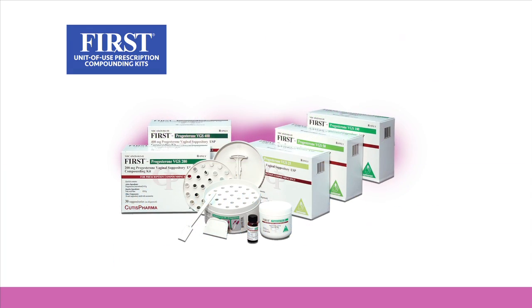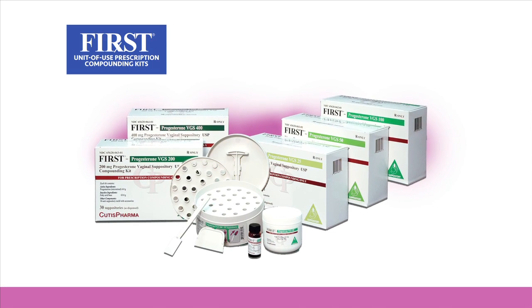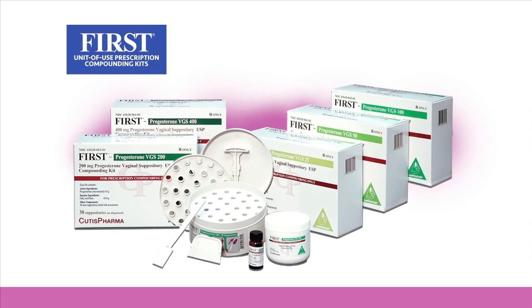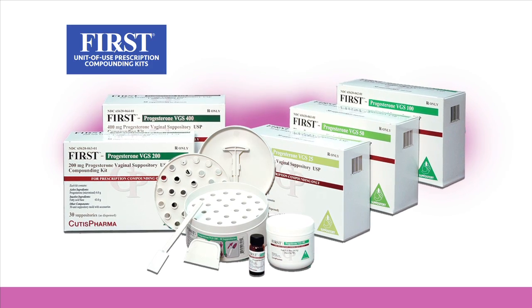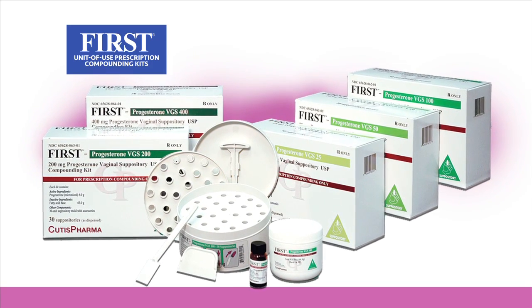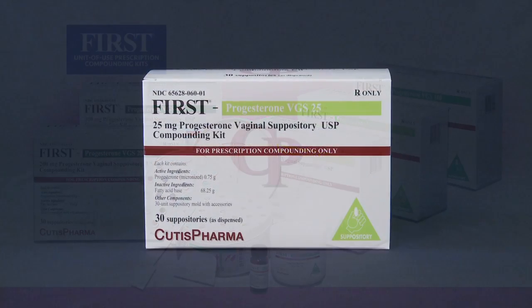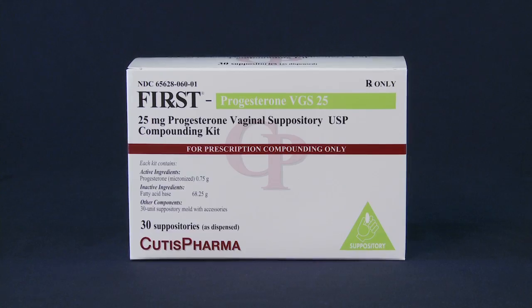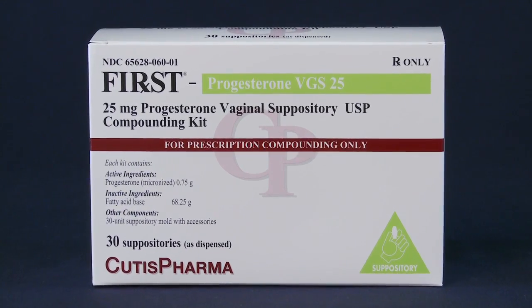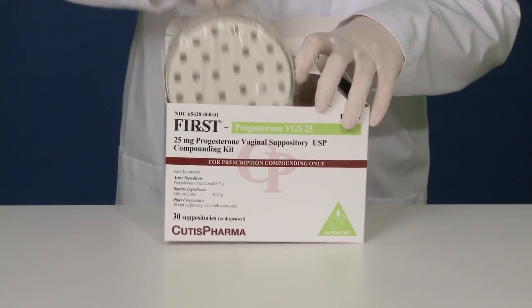First Unit of Use Compounding Kits make progesterone suppository compounding fast and accurate. Kits are available in 25, 50, 100, 200 and 400 milligrams. Everything you need to compound 30 progesterone suppositories is included in these easy-to-use kits. For this demonstration we will compound progesterone 25, but the procedure is the same for all of the kits. All ingredients have been pre-weighed to save you time and support accuracy.